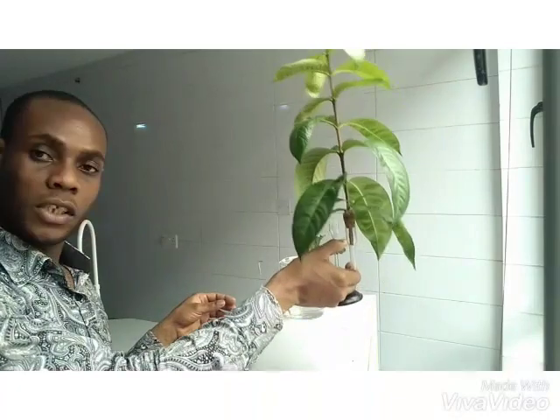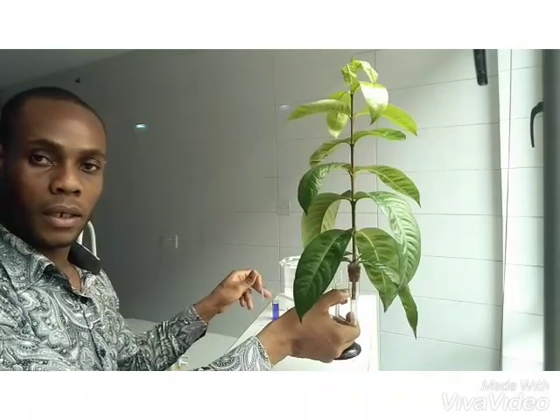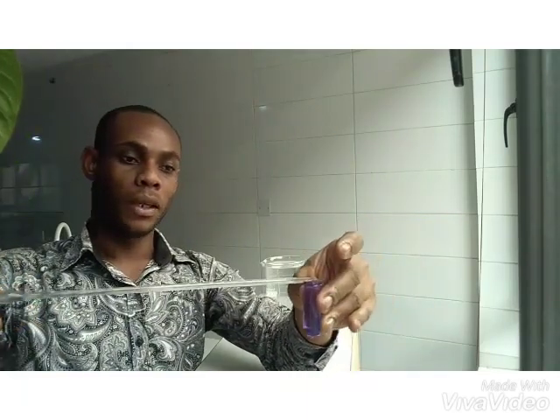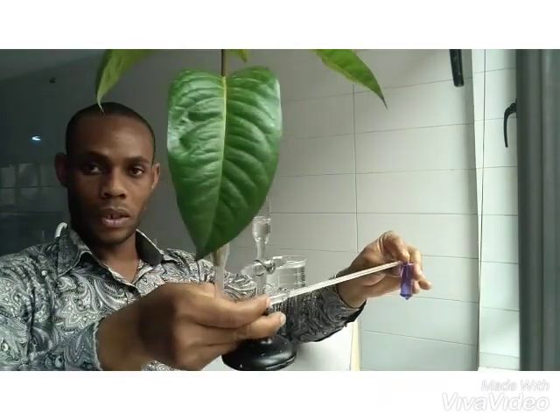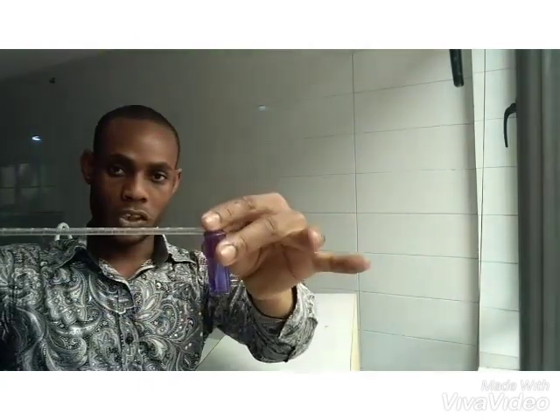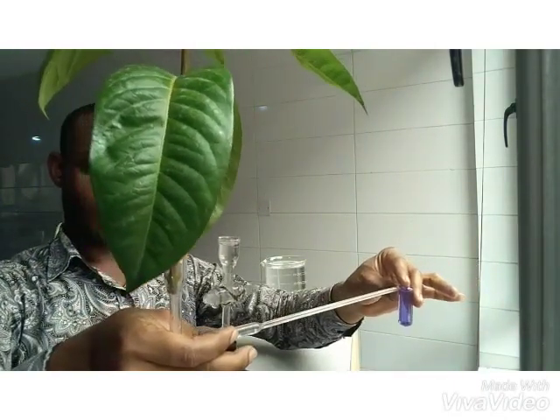We add water to the system and transfer it to the beaker. This is the whole setup. As the water gets used up by the plant, the water in the beaker is going to move up the capillary tube and keep moving until it gets to the plant. So after some time, the clear water in the potometer is going to become this color, and that is the indication that this plant is actually taking up water.